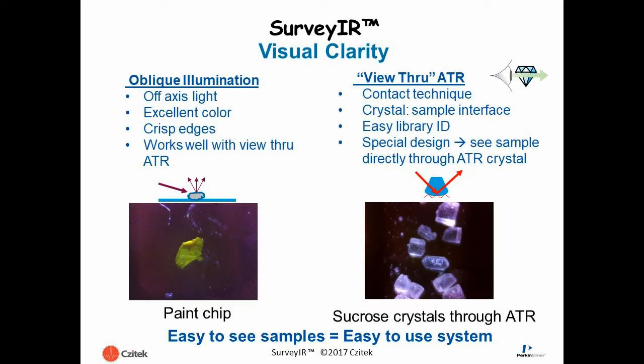In this presentation, we will demonstrate an analysis using Surveyor attenuated total reflection spectroscopy. In this case, the Surveyor is interfaced to a Perkin-Elmer Spectrum II FTIR spectrometer. In this example, we're going to be using a Diamond ATR sample analysis method.